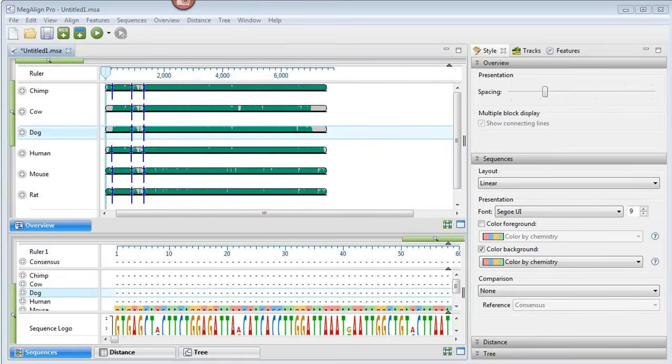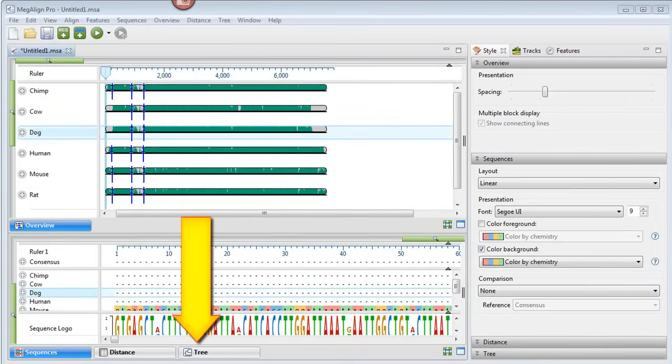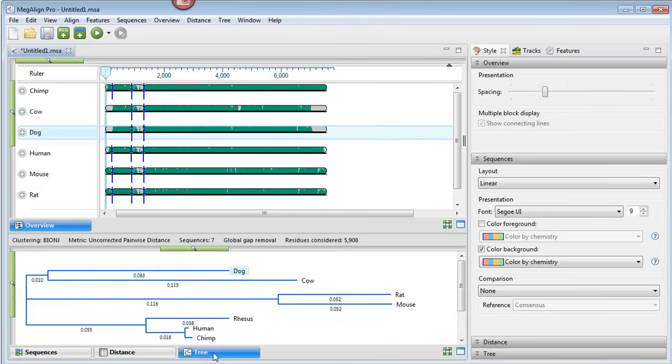Once the alignment is finished, we can easily see the phylogenetic tree by clicking on the Tree tab at the bottom of the MegAlign Pro window.